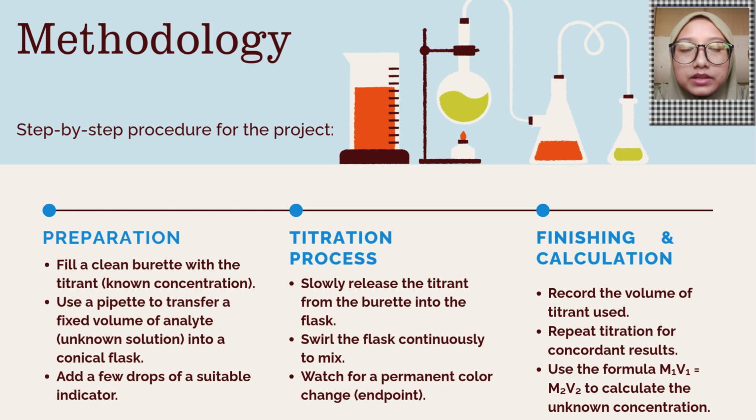As the titrant reacts with the analyte, the solution gradually approaches the equivalence point, the point where the moles of titrant and analyte are equal according to the balanced reaction equation. The key moment in titration is identifying the endpoint, which is when the color change from the indicator stays permanent. At this point, the reaction is considered complete. The volume of titrant is recorded from the burette.